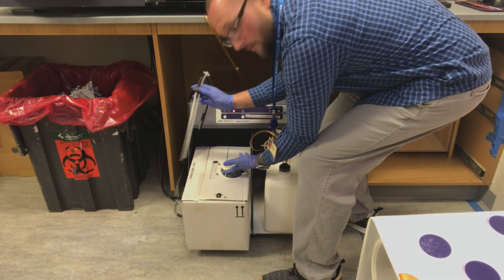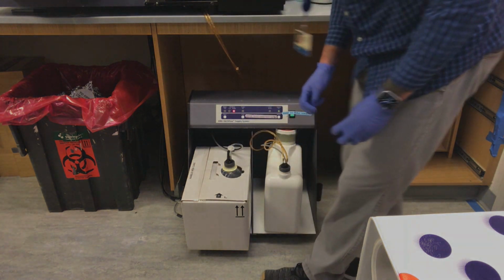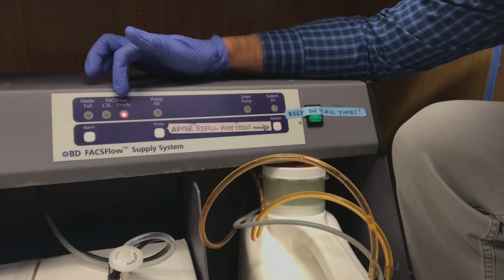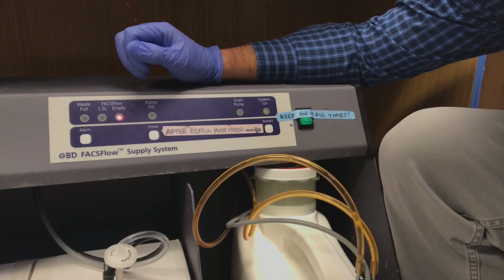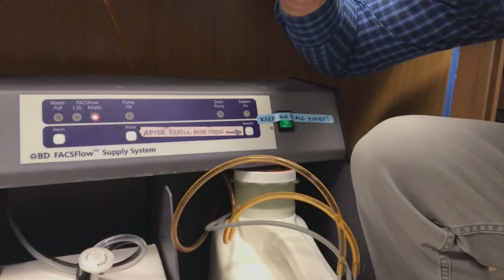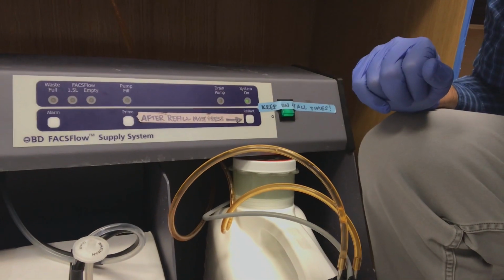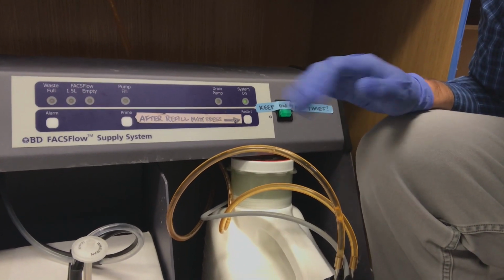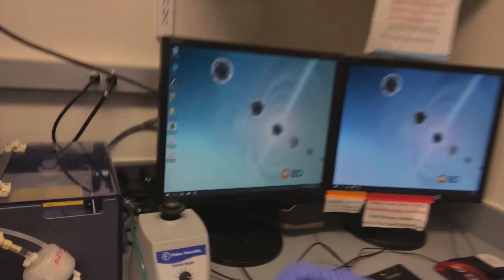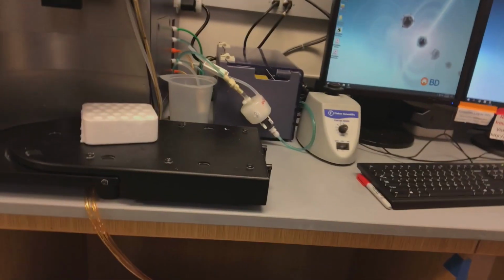Now that we have the full tank, I'll lift the cube up a little bit, put our probe in, and just gently hand tighten the probe into place. Now what's very important to notice is that one of the alarms, the 1.5 liter warning, has now reset itself. However, the empty alarm has not reset. This is vitally important that you manually restart the wet cart. This is because if you do not do that, the machine can still operate and will draw liquid from this side tank and empty without being constantly replenished from the wet cart below.